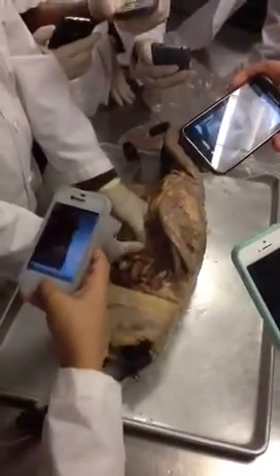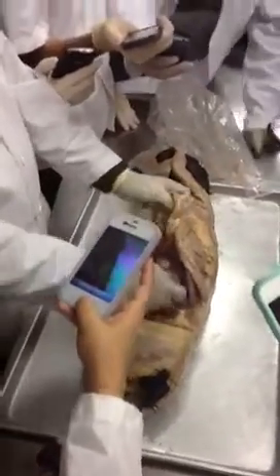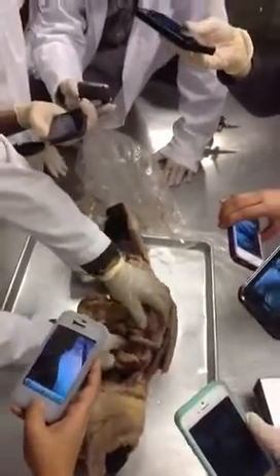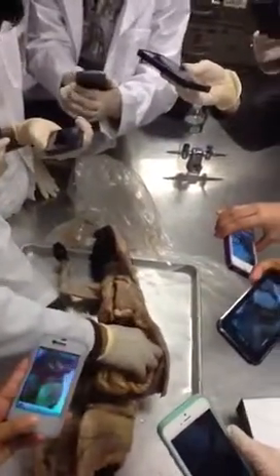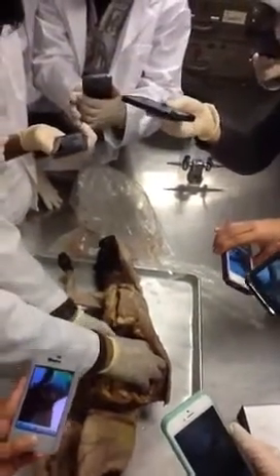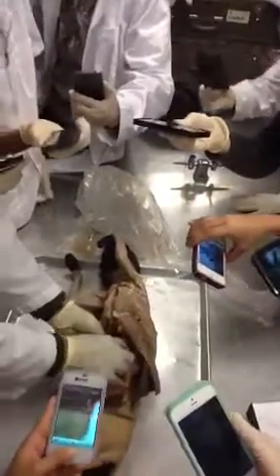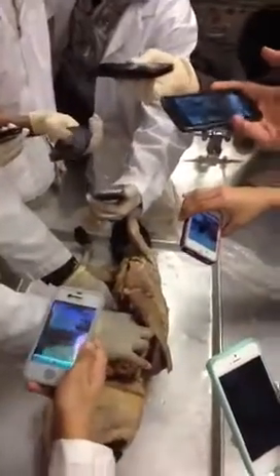Where's the duodenum again? Duodenum is the beginning part of the small intestine. Very difficult to see in case of cat because the stomach is right here. We will eventually take off the greater omentum, but this is the stomach, as you can see. Stomach continues as duodenum. So this initial part of the small intestine is duodenum.